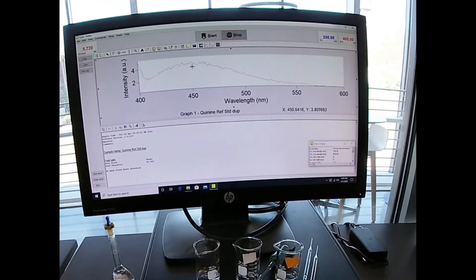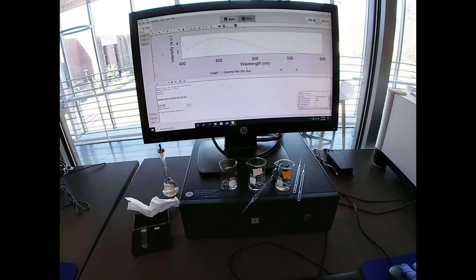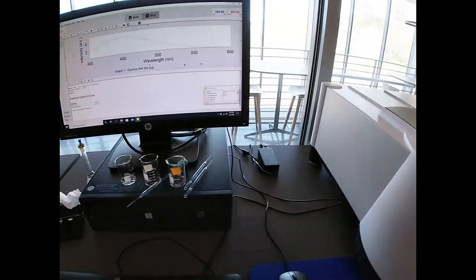So there's our scan. You can see we have a peak right around here. The peak is right around 450. I guess we can measure our blank next.